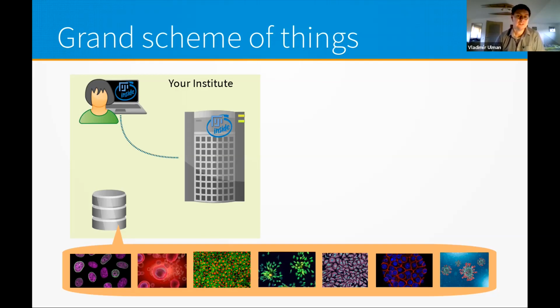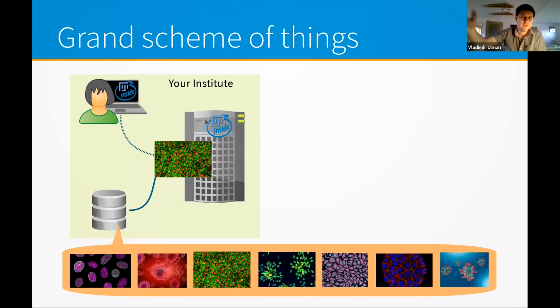Basically, this is a remote desktop session, VNC, TeamViewer, and these kinds of things. You probably connect from your laptop to the workstation, and on that workstation you run Fiji, we assume. And that computer is of course hooked to the file server, and it's taking the images one by one and processing them.